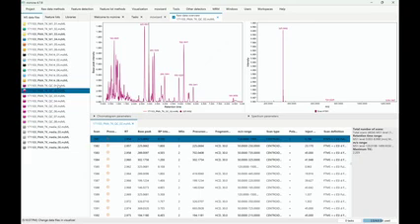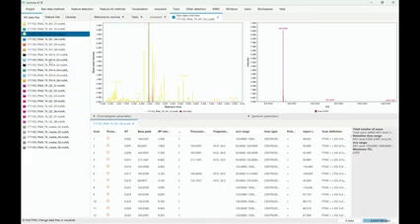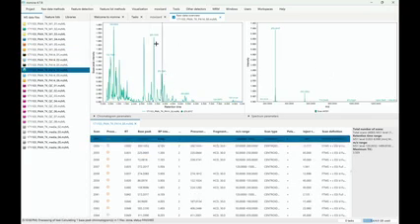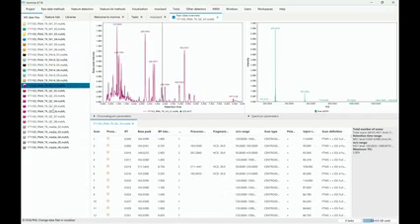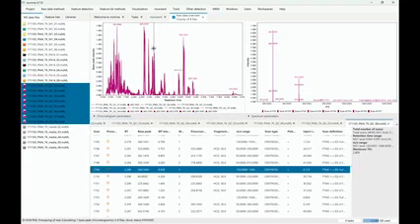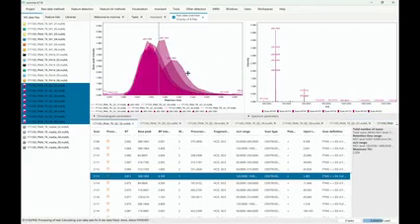If you see the checkbox, it usually means that if I now click into any other sample on the left, it's going to pick out the chromatogram. I can pick out the spectra again. And if I select multiple, you're going to see that we overlay multiple samples and also multiple spectra if I just click into any of those chromatograms.